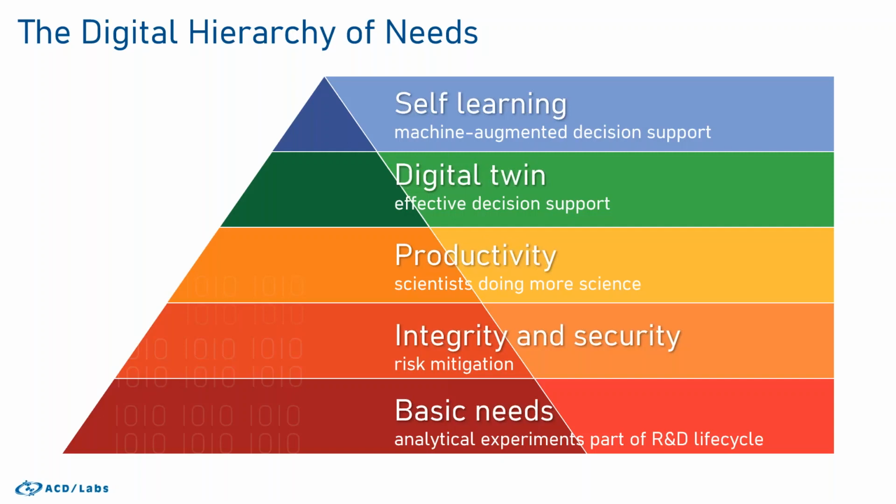And then you may have a system that should be in place that will assemble the analytical data and pull together other types of information to present a digital twin of your experimental studies. And this digital twin is further used upstream in terms of a machine learning type of decision support framework. So that's ultimately the goal. But in order to figure out what types of systems are required for the lower levels, we really need to think about how the data is being used by the scientists in the lab today.